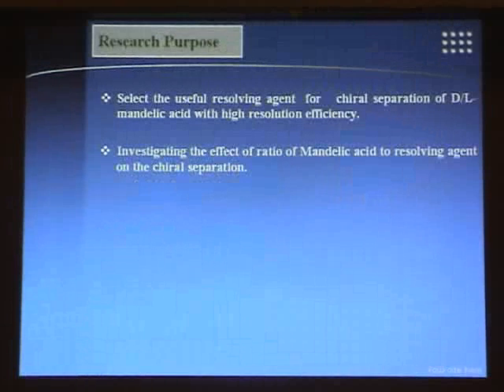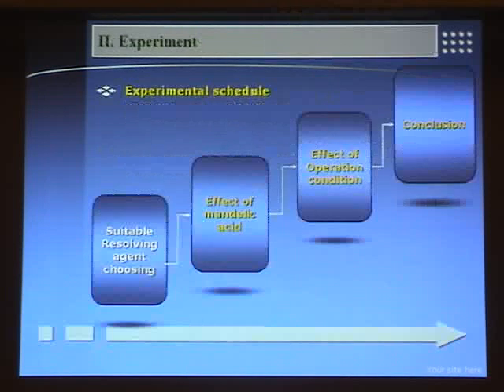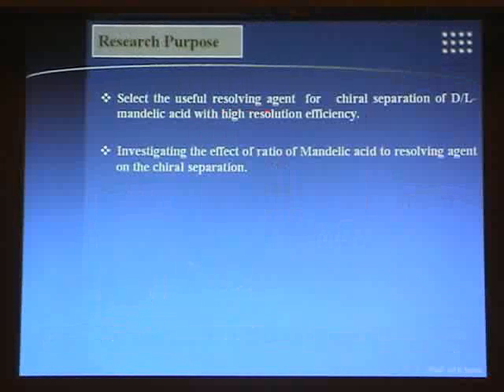So we try to investigate and find some resolving agent for chiral separation of mandelic acid with high resolution efficiency. And the second purpose is I want to investigate the effect of the ratio of mandelic acid to resolving agent, and then suggest some molecular structure for separating chiral compounds.